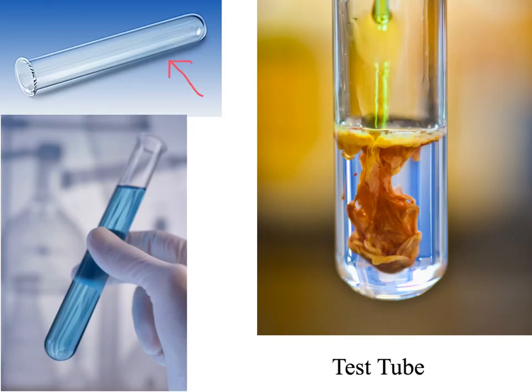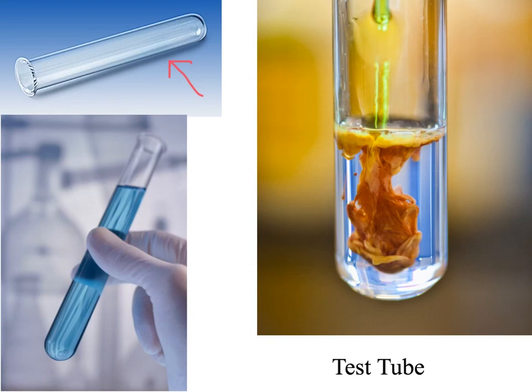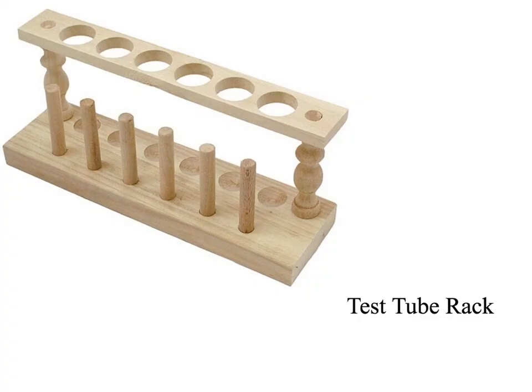This is a test tube and we'll be using them many times in the lab. Their function is very simple: to observe chemical reactions. We take a chemical, add something to it, and the test tube allows us to observe the interesting chemical reaction safely. This item is called a test tube rack, and its function is simply to hold the test tubes — the test tubes go right in, and it holds them.